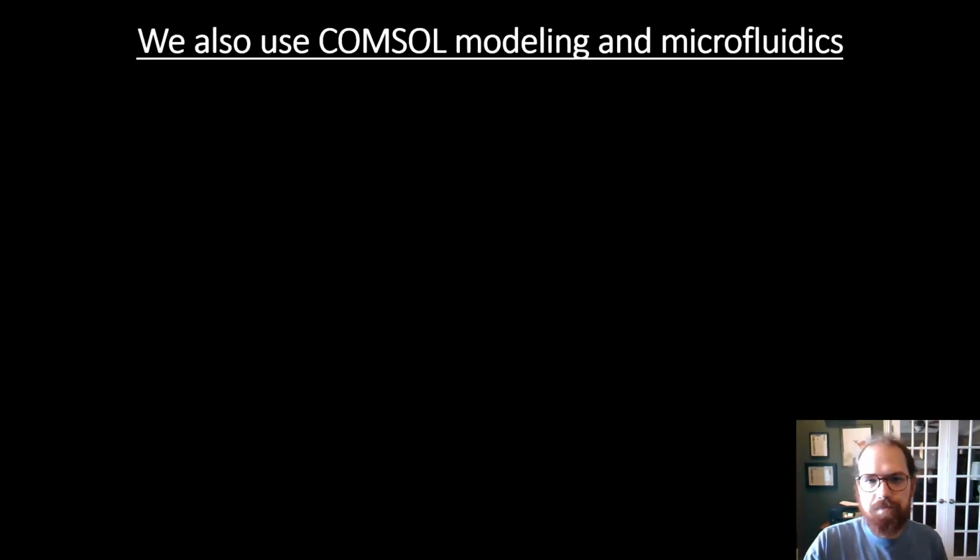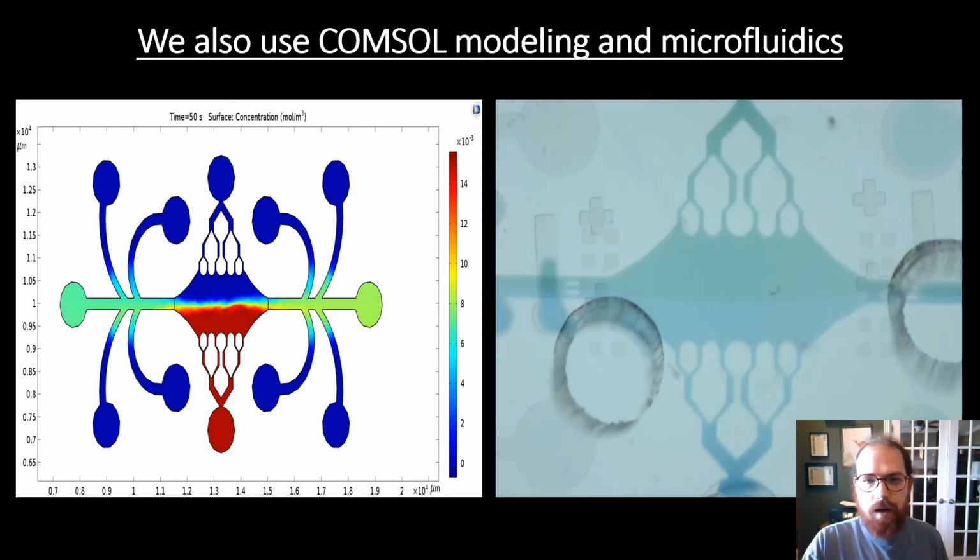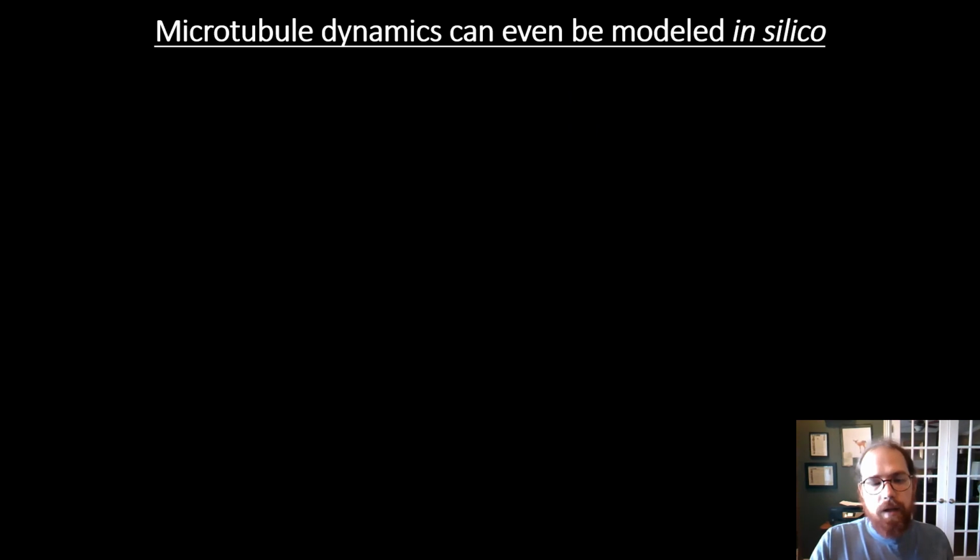Furthermore, we can use COMSOL, a computational fluid mechanics modeling software, in combination with microfluidics in order to yield very robust flow profiles in the device and help us better understand microtubule mechanics as well as their dynamics. And we can actually take it a step further and even model the dynamics themselves using computational modeling.